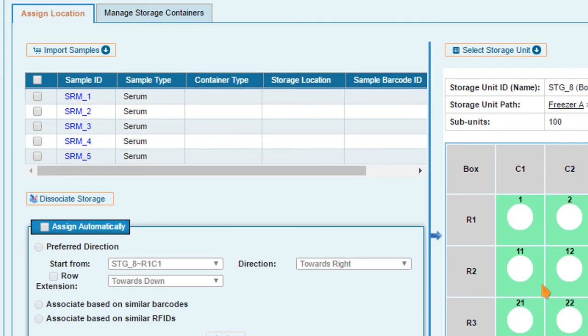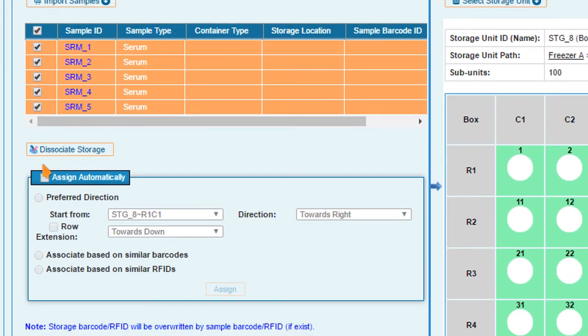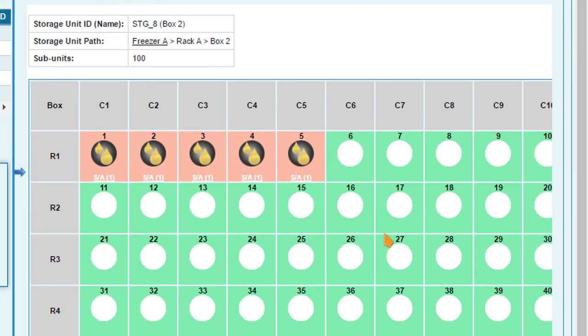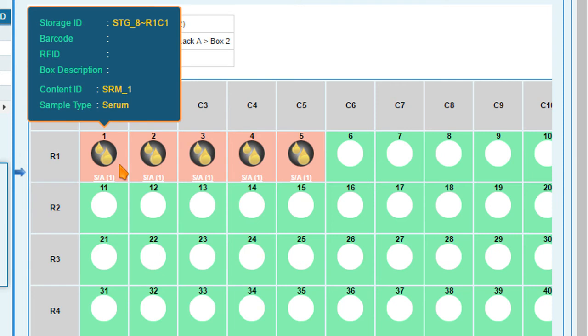Select the samples again and check Assign Automatically. Now click Assign and CloudLimbs Lite automatically assigns a storage location to each sample selected. By hovering the cursor over the location, get a preview of the sample storage in each cell.